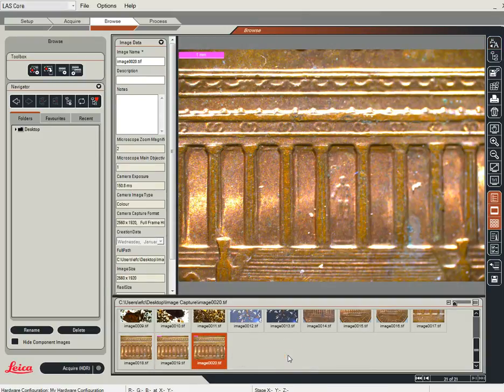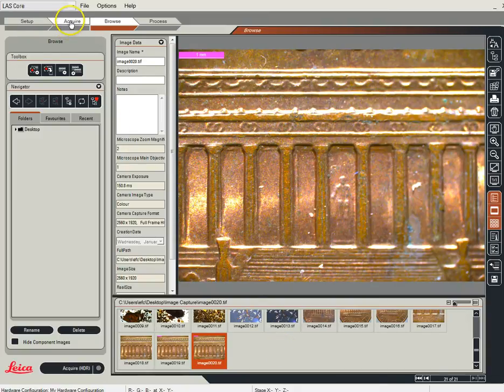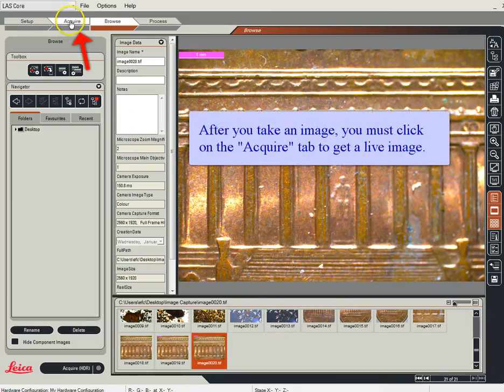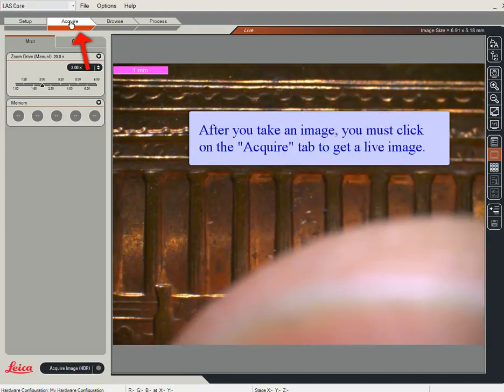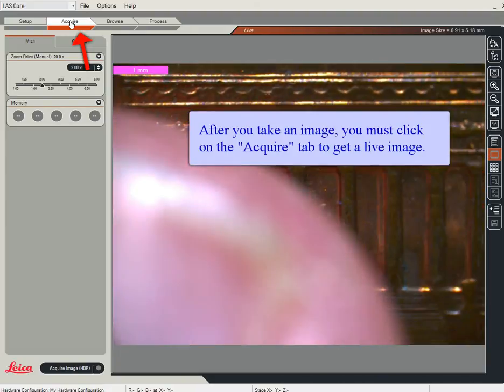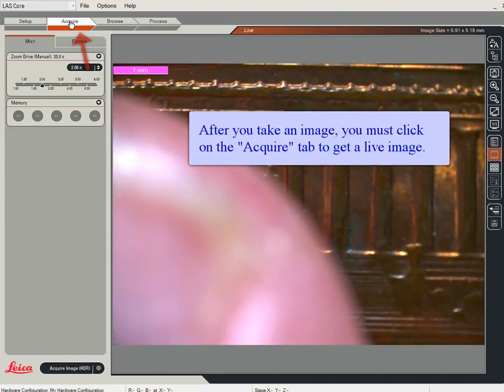You'll notice I'm moving the penny but it's not actually moving because this image is locked in place. So what I have to do is tell the scope that I want to go live again. I'm going to click on Acquire at the top — there's my live image again and I've got good old Abe there.